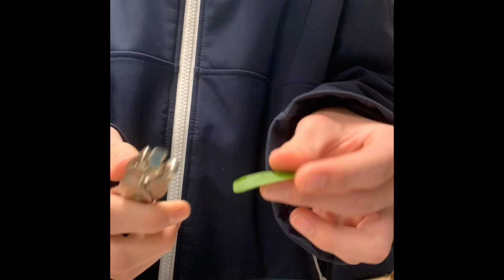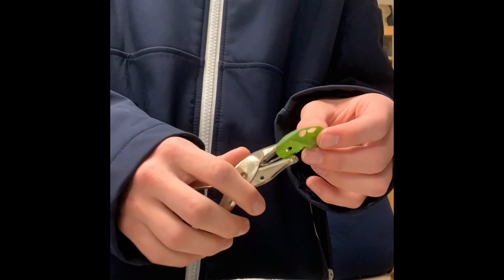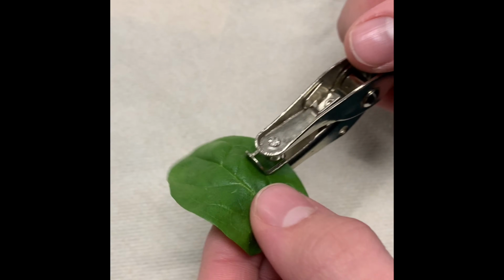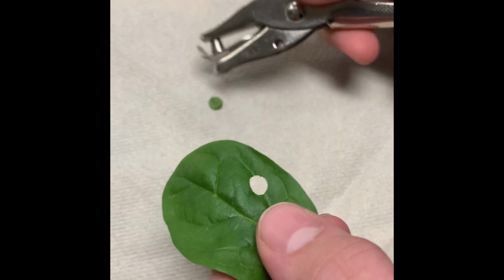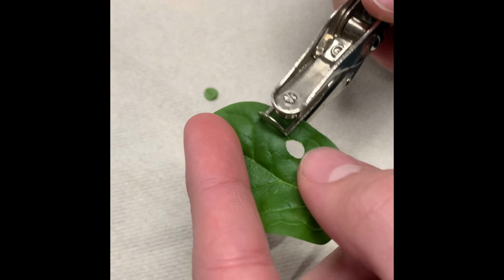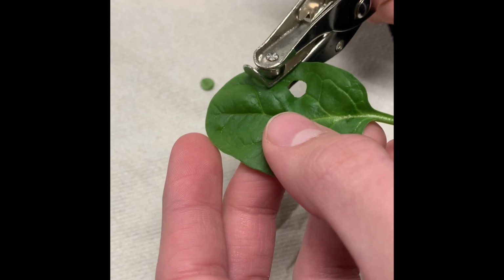After gathering all the materials needed, the next step will be to cut out 60 spinach leaf discs with your hole puncher. To ensure that your research is uniform, make sure that all your leaf discs are similar in texture and thickness while avoiding major leaf veins.